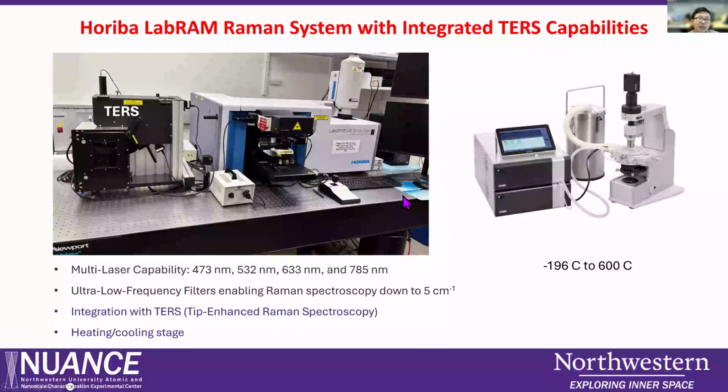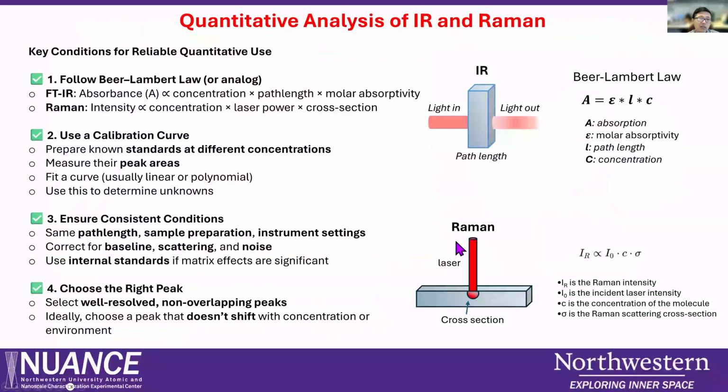So this is our system in our facility. We have the Horiba Raman system. We also have a TERS, tip enhanced Raman, and also a heating cooling stage, so you can do in situ analysis. For IR and Raman, you can also do quantitative analysis.